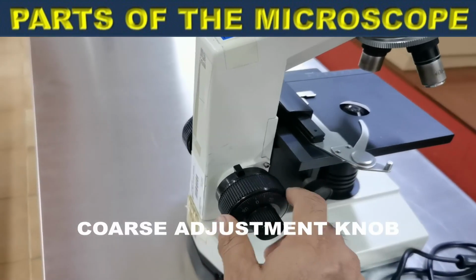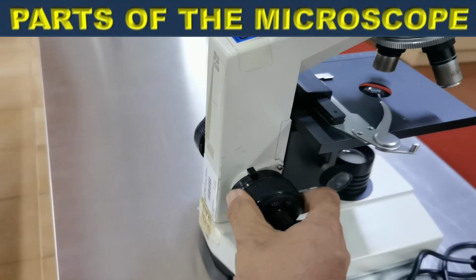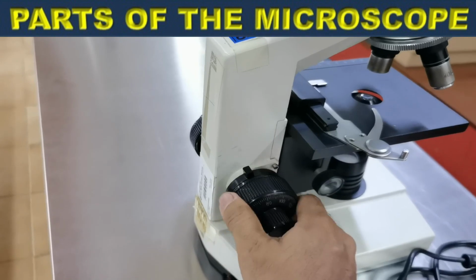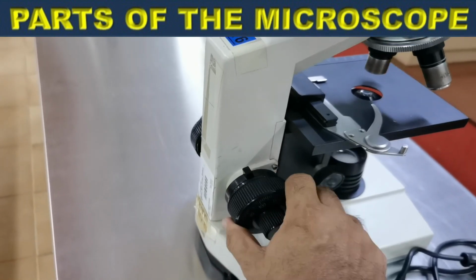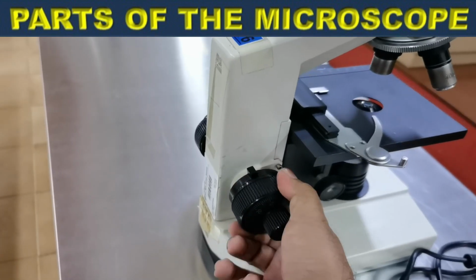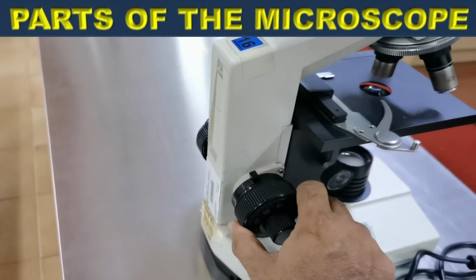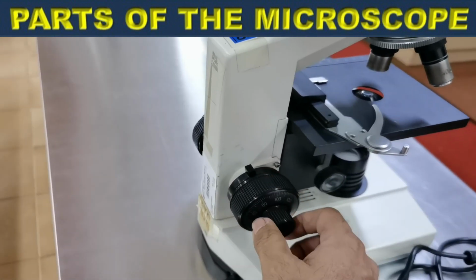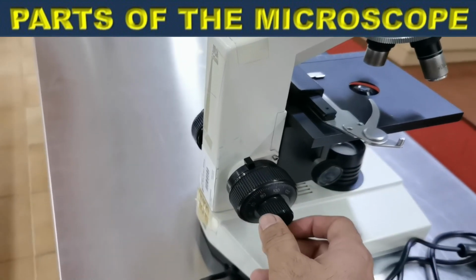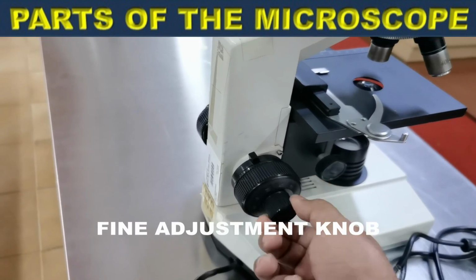Now in this microscope, if we move the coarse adjustment knob, you will notice that it moves the stage either up or down, so that we can achieve the proper focusing of the image. Now if we want to refine or adjust the focusing even further, we can use the fine adjustment knob right here.